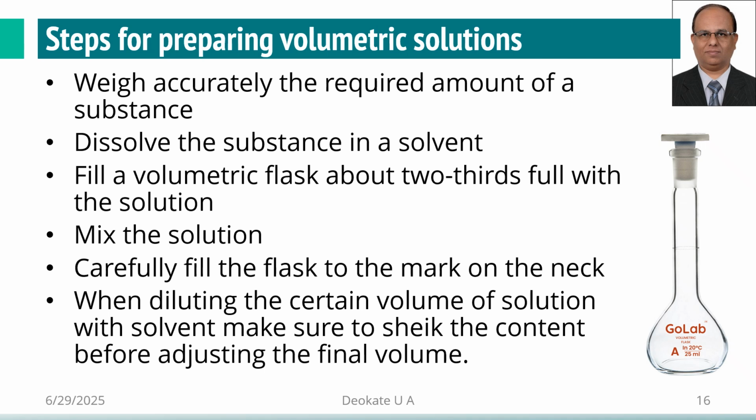Mix the solution thoroughly. Carefully fill the flask to the mark on the neck. Whenever we are adding the solvent, we may make a mistake in dilution, so that your solvent level will be above this line. Excess addition of the solvent will destroy your solution. So be careful about this.